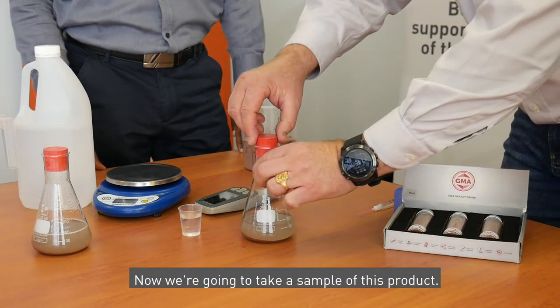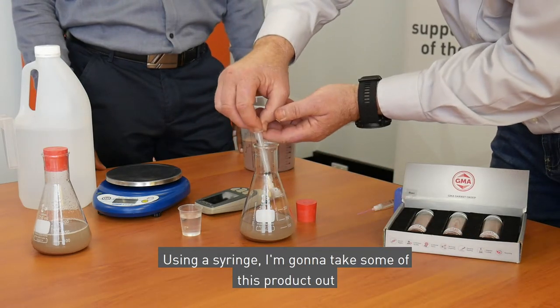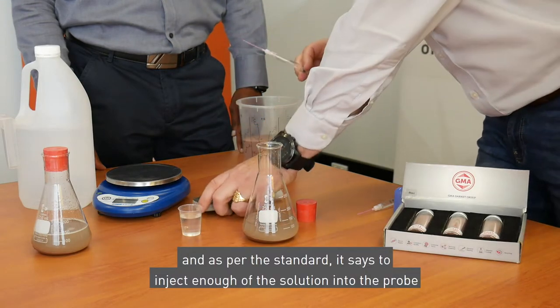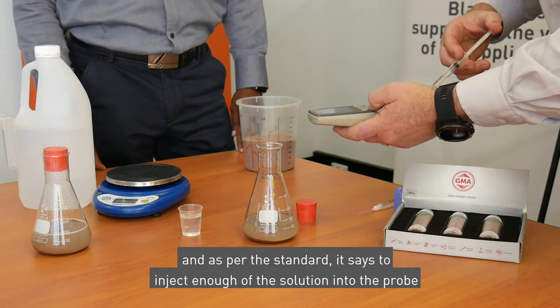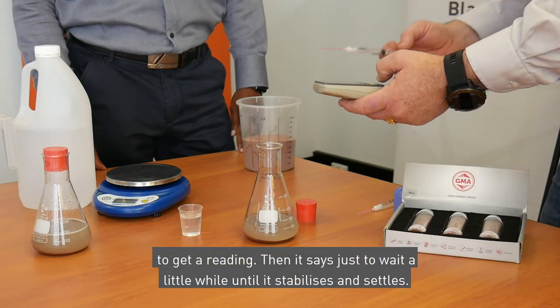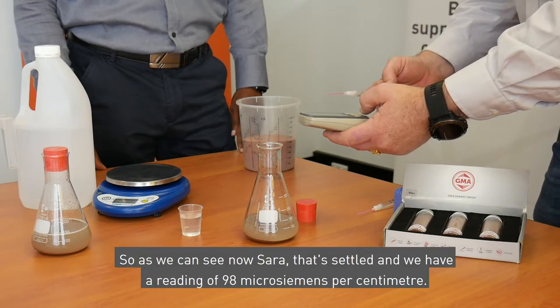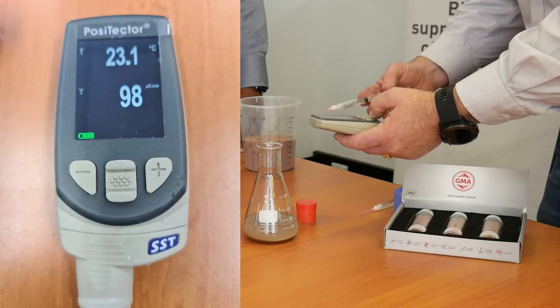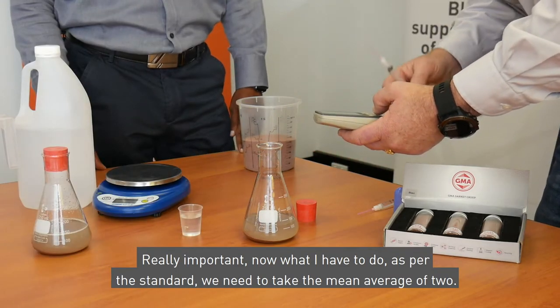Now we're going to take a sample of this product using a syringe. I'm going to take some of this product out and as per the standard it says to inject enough of the solution into the probe to get a reading. We just have to wait a little while until it stabilizes and settles. As we can see now Sara, that's settled and we have a reading of 98 microsiemens per centimetre. Really important — as per the standard we need to take the mean average of two readings.